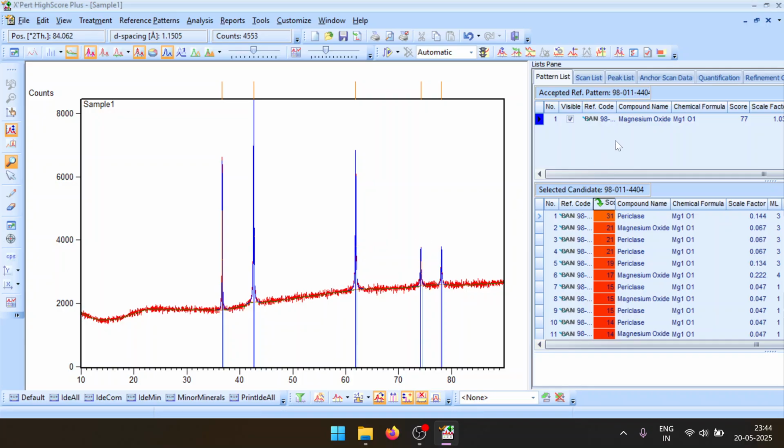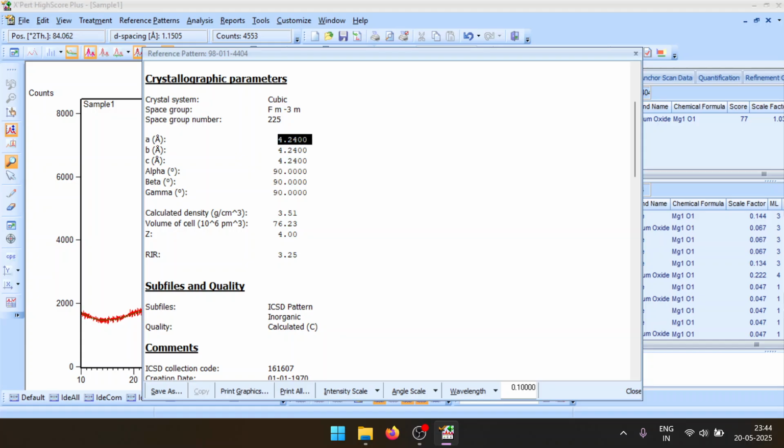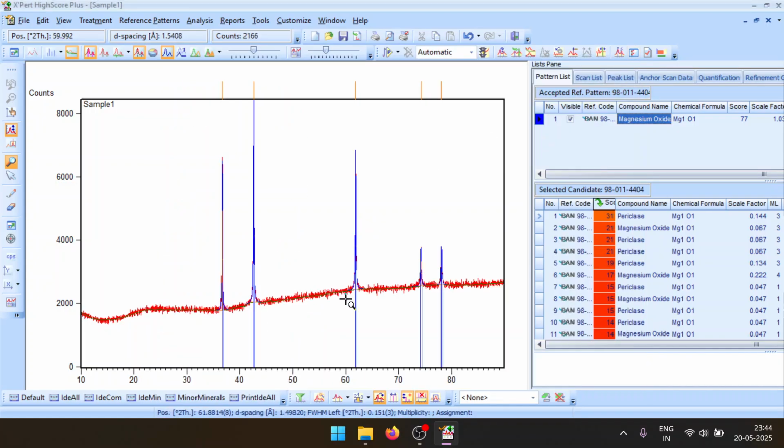So if you want to do it correctly, you can't just mention that my ABC are just 4.24 angstrom. You need to find out what your sample's ABC are. For that, you need Rietveld refinement. That is what generally Rietveld refinement is.